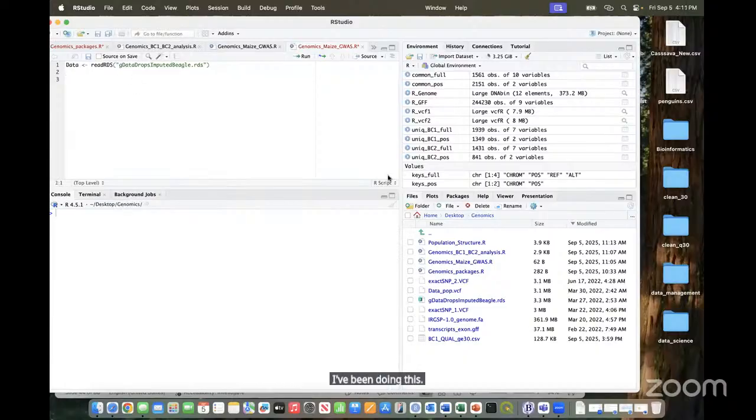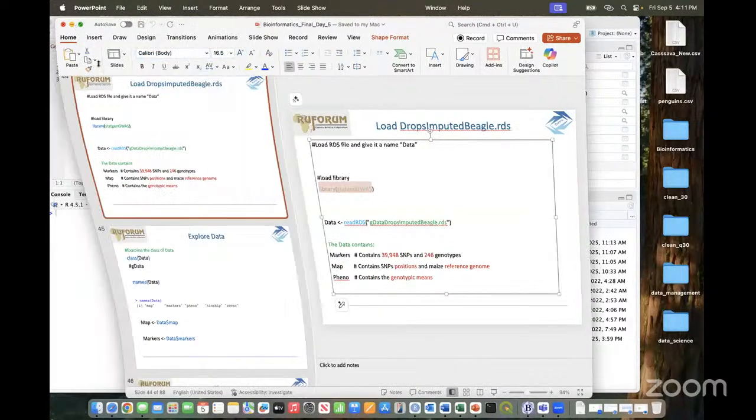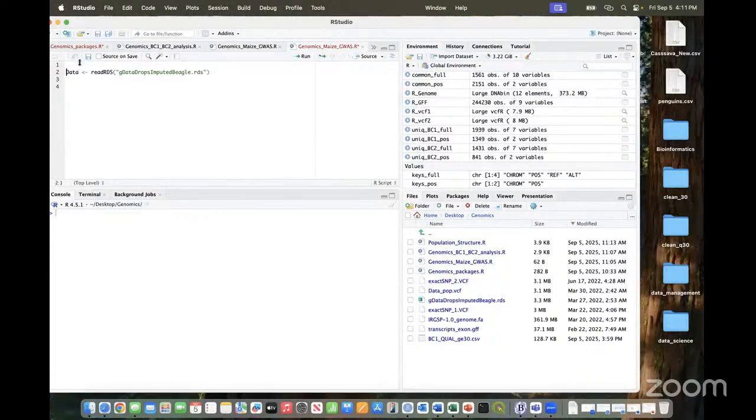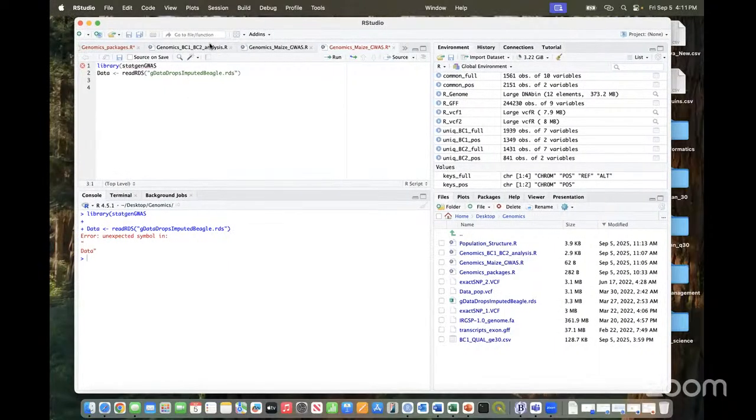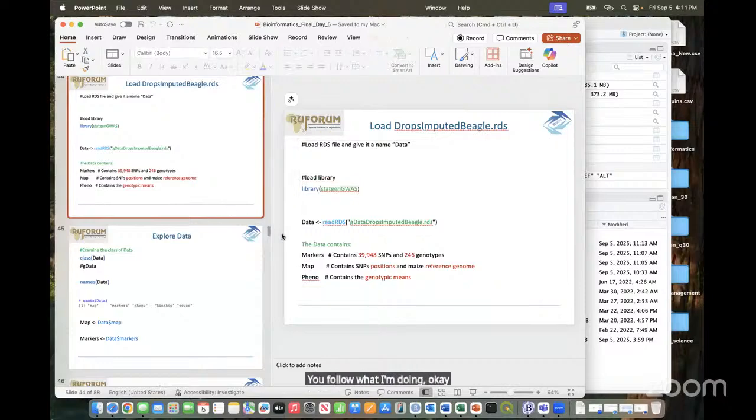Start with library first. You follow what I'm doing, okay? And then I'll explain exactly what's going on here.